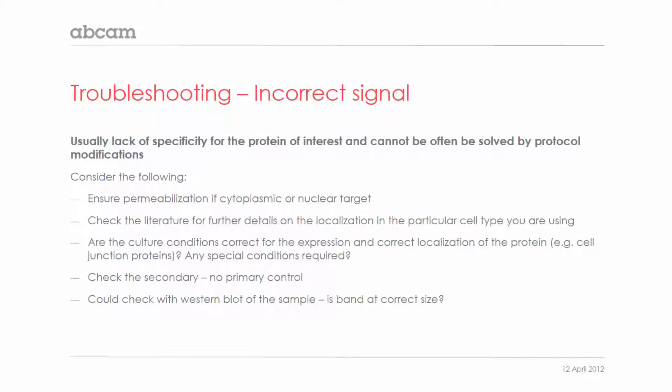Check the secondary antibody with a no-primary control to make sure it's not binding nonspecifically. If you want to take it a step further, you could check your sample with a western blot and confirm that the band observed is at the correct size for your protein.